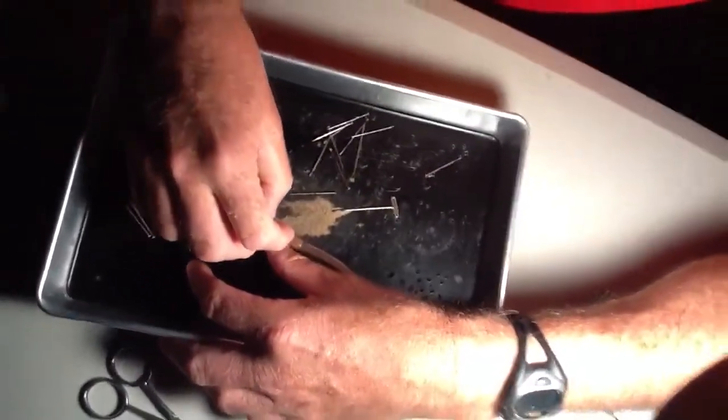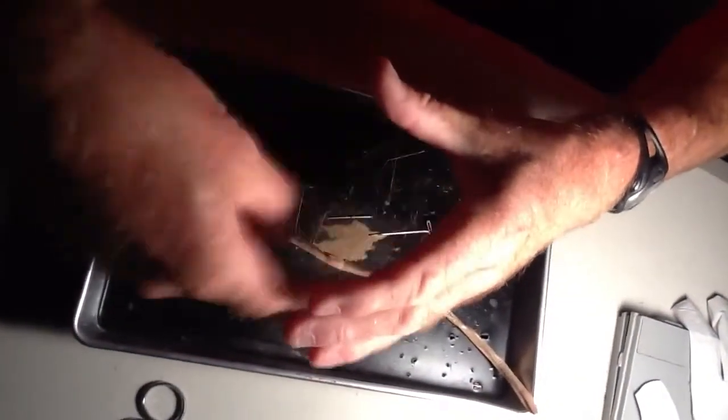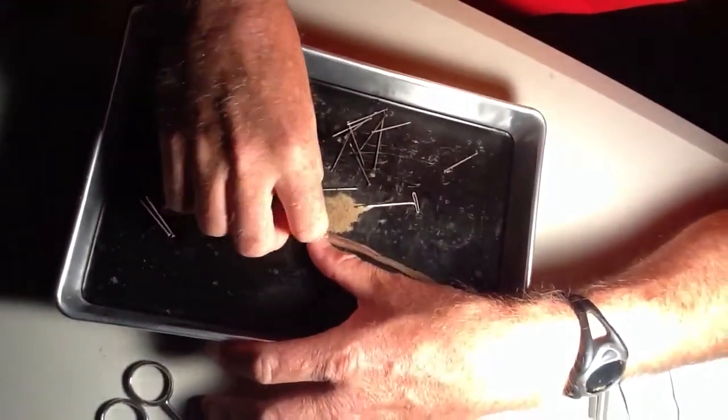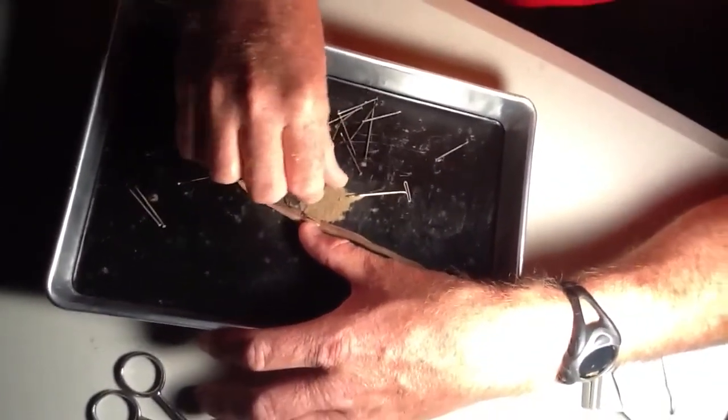Same thing up here, just kind of put the pin in the side and scrape it. So basically what I'm doing is scraping along the side right here, so that it opens up. Does everybody understand that? I'm not going to show you the parts. All we're going to do is get past this, and if we get done with this today, then I'll go over the parts of it in a few minutes.